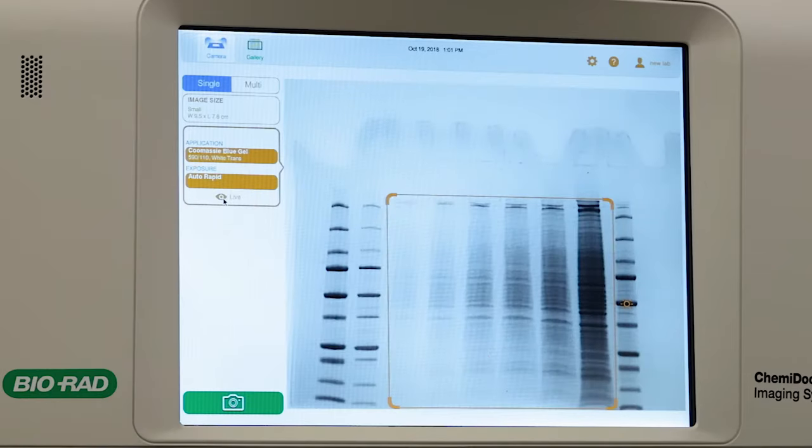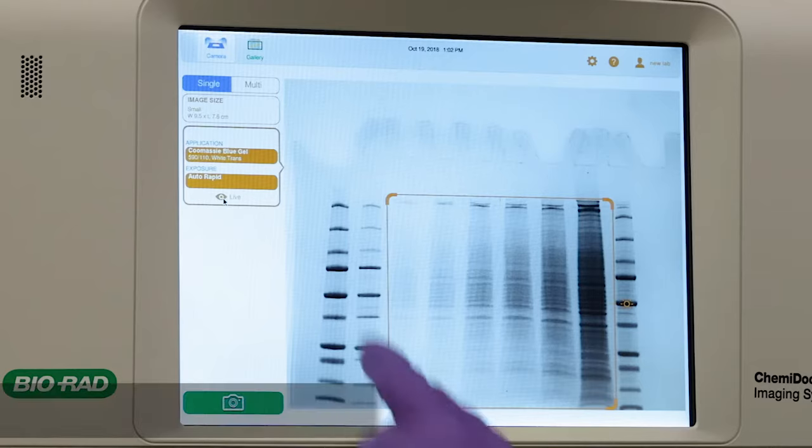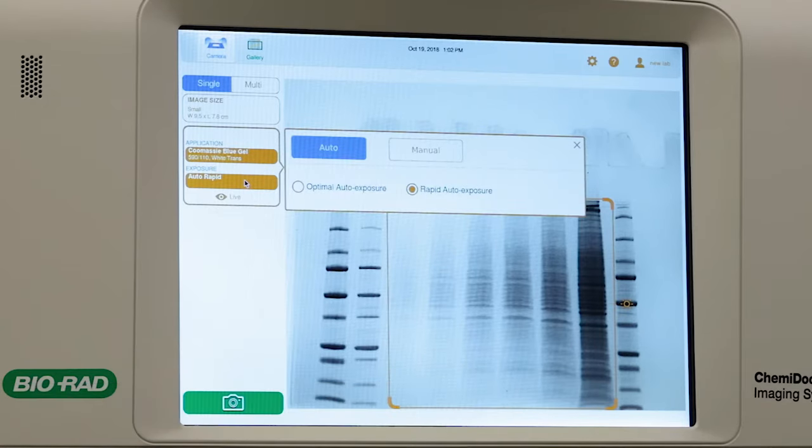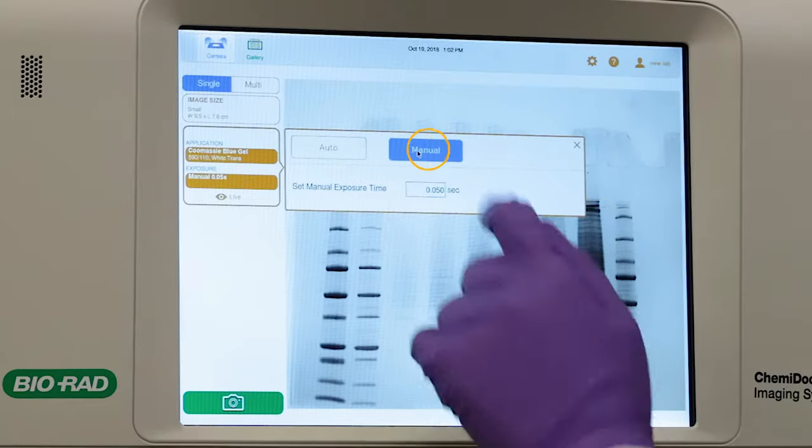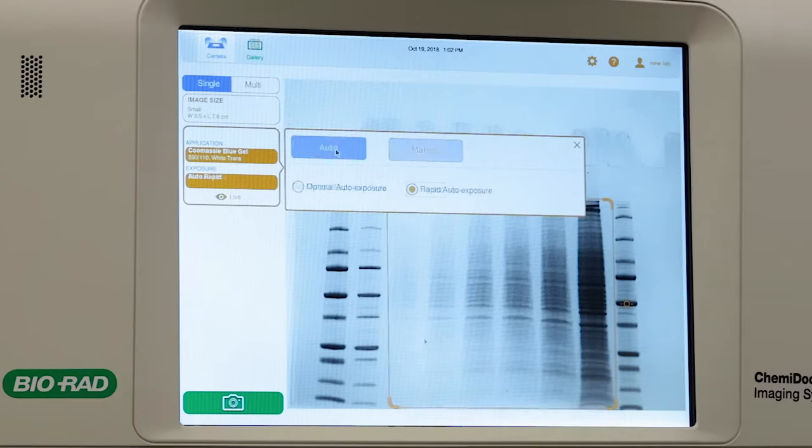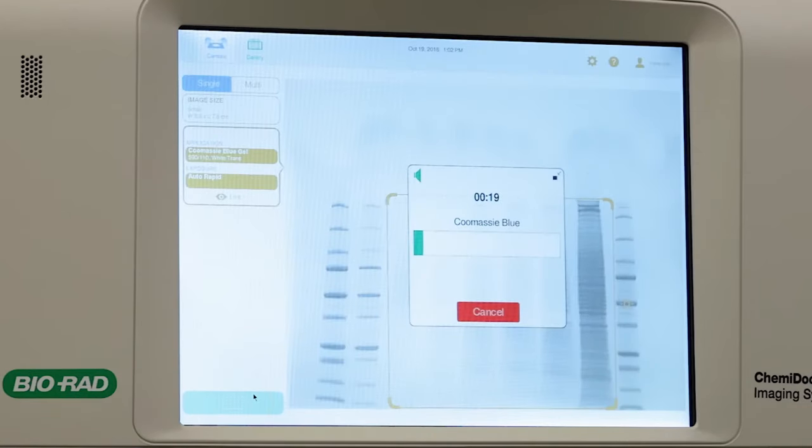You can take a preview of your image and set your region of interest. This can be used for excluding very bright areas that you won't want to quantify, such as your marker. Choose between entering your exposure time or enabling automatic detection of your bands. Tap the camera button and capture the image.